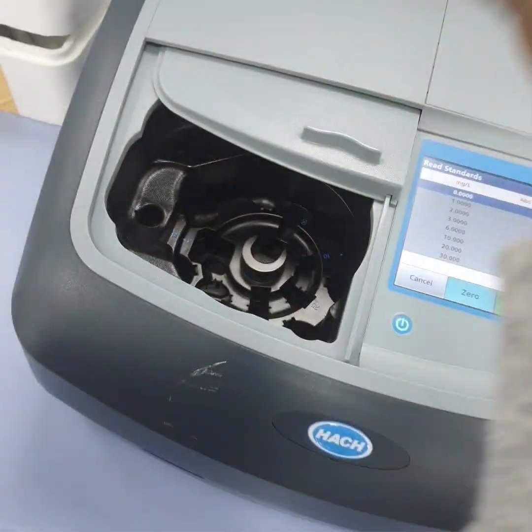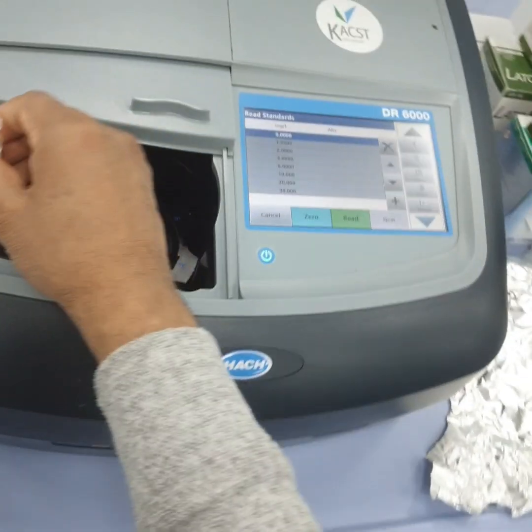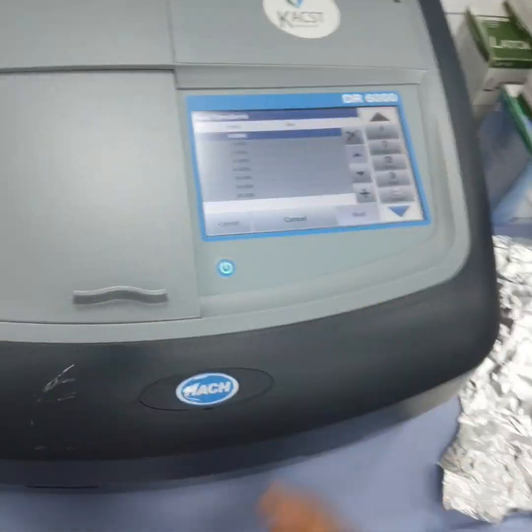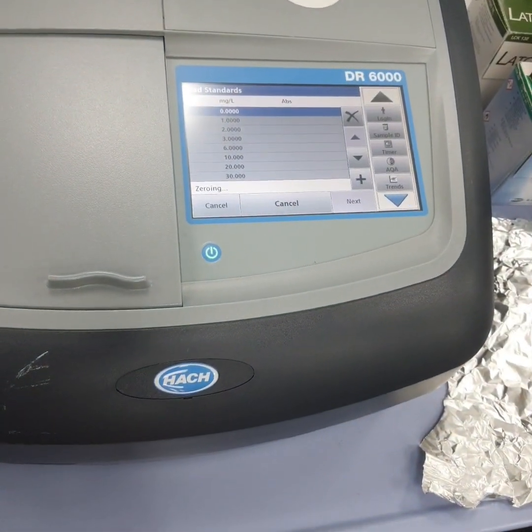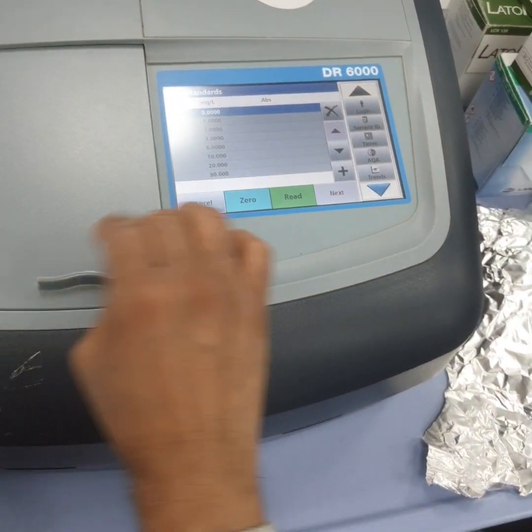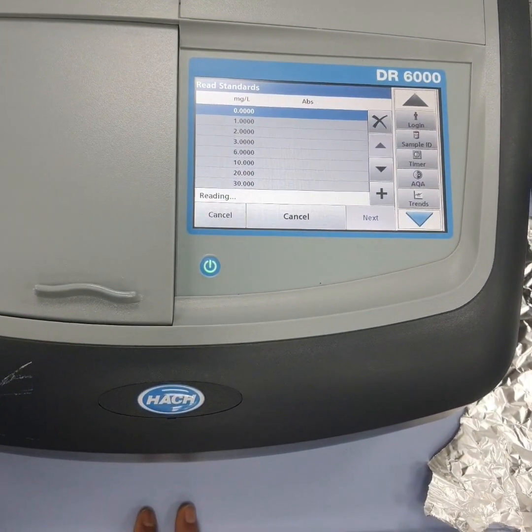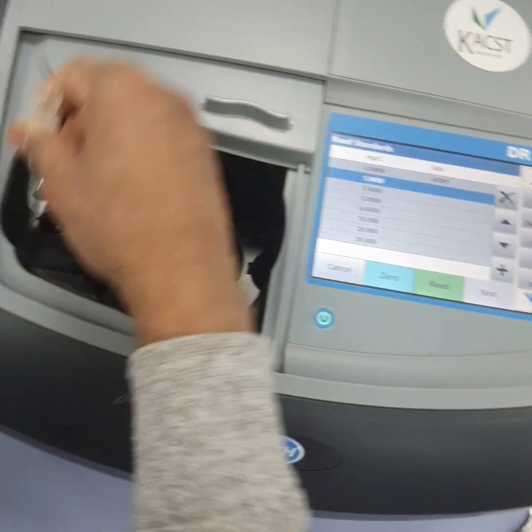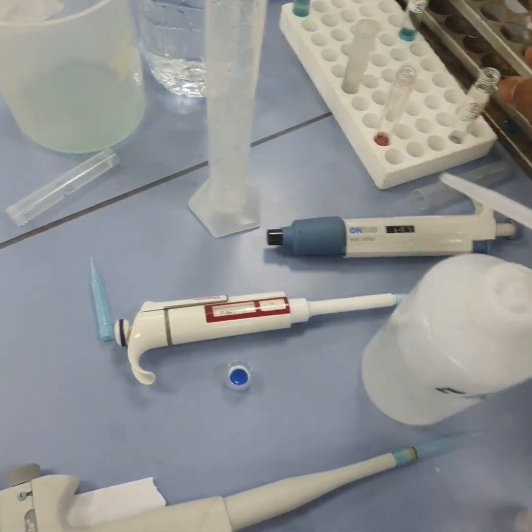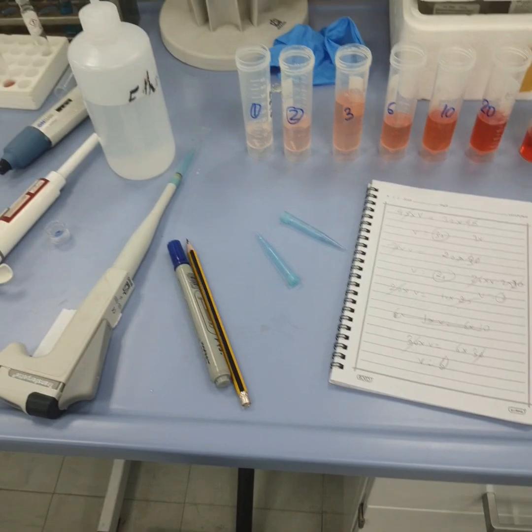So this is my 30. So water here, then 0, again the same one we will read. So it's showing -1. Okay, now we need to transfer 1 to the vial.